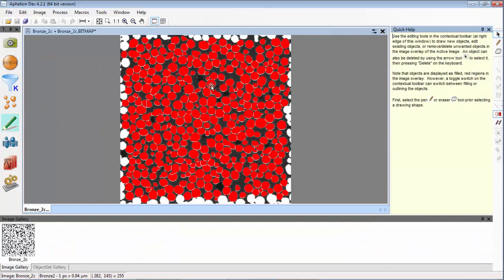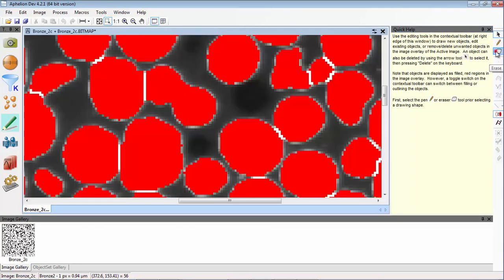If necessary, we can manually edit the results to separate objects that are still touching or reconnect objects that should be together.